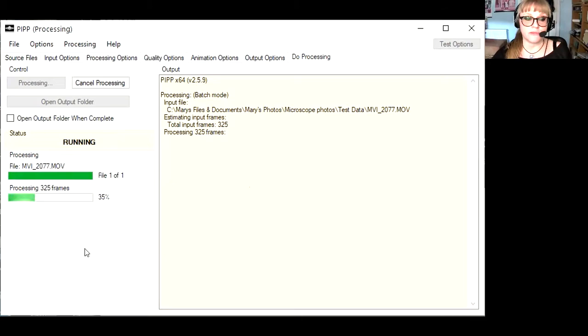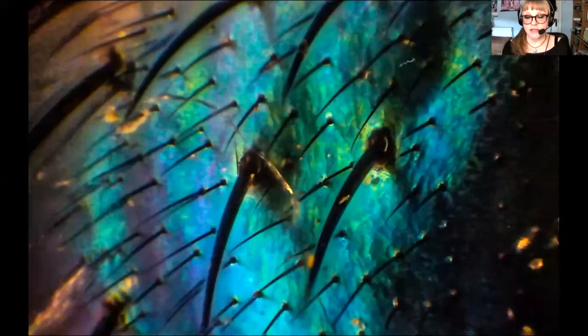This is the photograph that I ended up with when I stacked those images. I didn't stack all 300 and odd of them. I just basically stacked every third, so it was around about 100 image stack for this particular picture. You can see that you get in a lot more detail. Now obviously this is still frames extracted from a video, so they're not the highest in terms of resolution, but it kind of does the job. Given the equipment that I'm using, which is very basic, I'm actually quite pleased with how this result turned out.